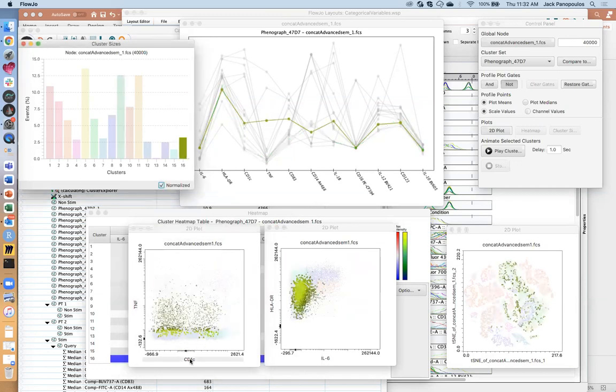With respect to CD1C expression, looking at it here, I can clearly see that it is in the negative end of the graph. We've got this really wide spread negative population. The positive stuff is most likely what we had out here that we were pressing up against the axis. So I probably could have done a better job of transforming this.